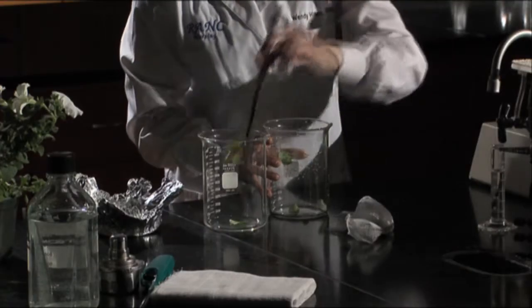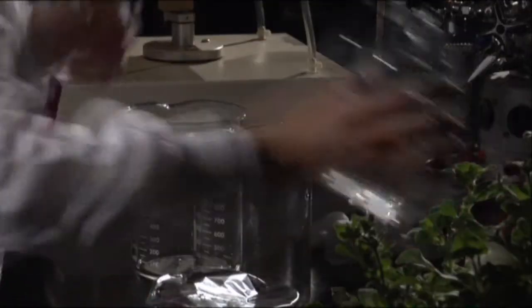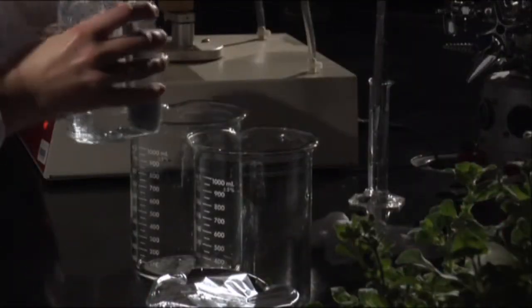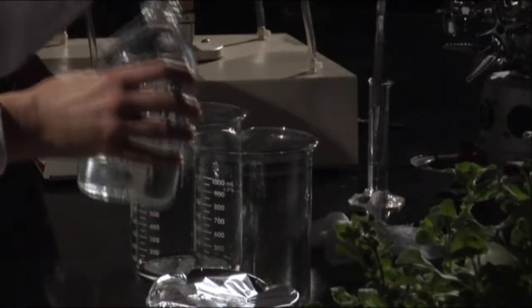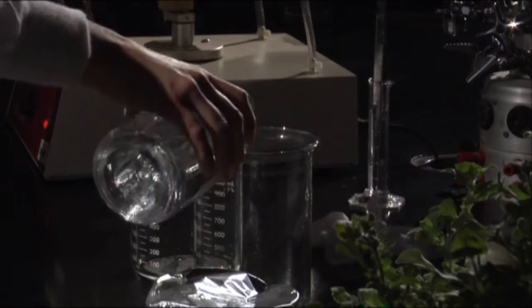Place the washed leaves in a sterile beaker and add 10% bleach with a few drops of detergent. Make sure that there's enough to cover the leaves.